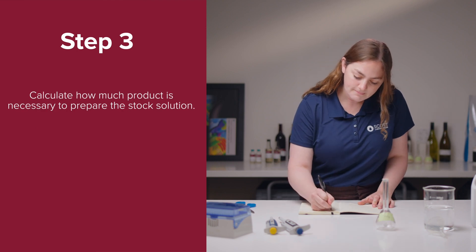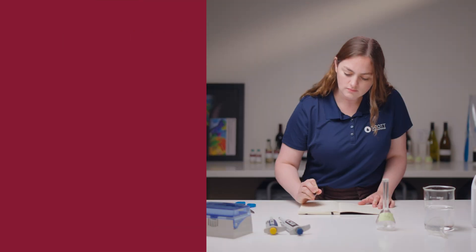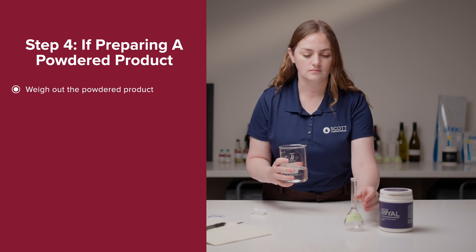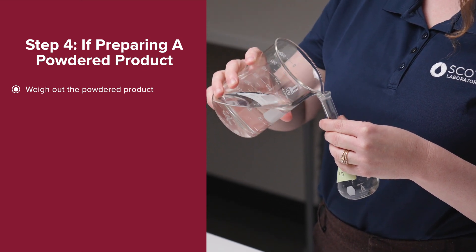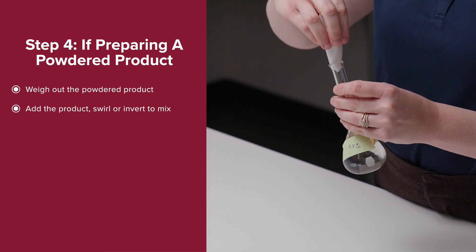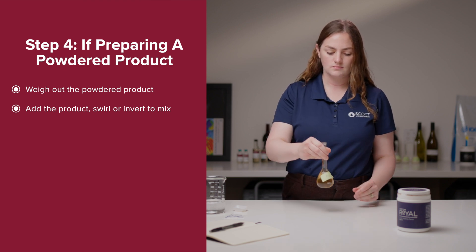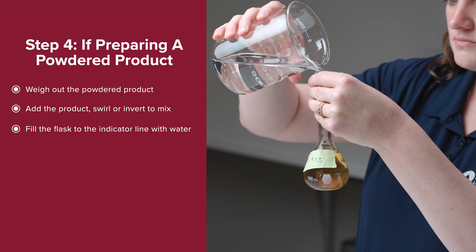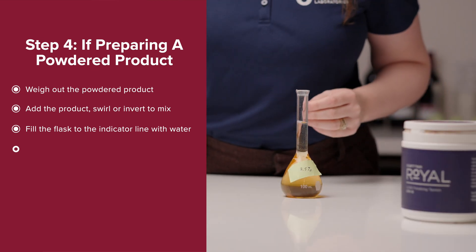Step 3: Calculate how much product is necessary to prepare the stock solution by using the worksheet on the screen. It is also available on our website and the link can be found in the video description. If preparing a powdered product, begin by weighing out the amount of powdered product calculated in the last step. Fill the volumetric flask halfway with water, add the product, and swirl or invert to mix. Fill the volumetric flask to the indicator line with water, ensuring the bottom of the meniscus is touching the line. Agitate or invert to mix again.